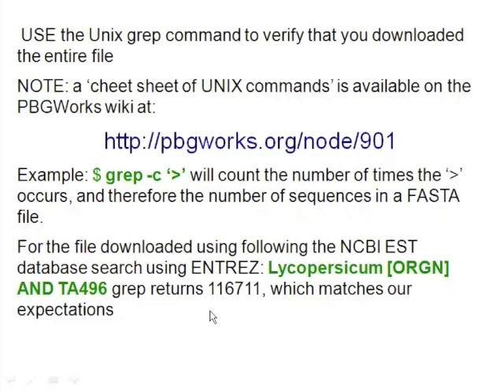That's a good sign, and it's an important quality check because sometimes when you're downloading data, if there's an interruption, you'll only download a portion of the data. You think you have it all and you've got a big file on your computer, but you've only downloaded a portion of it. This is a way that you can use Unix to double-check that you have what you think you do.